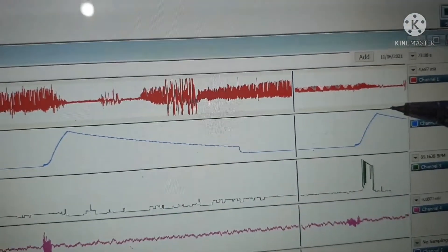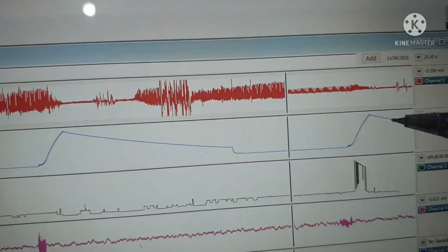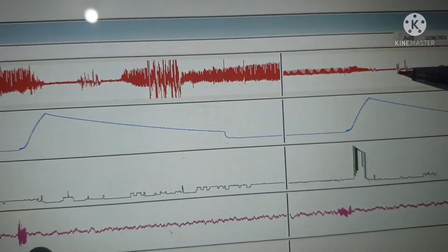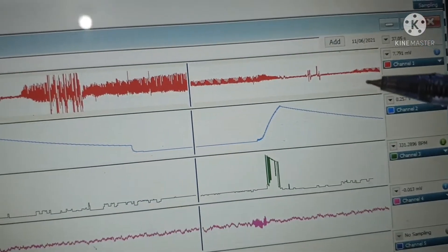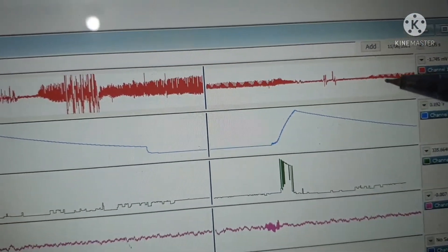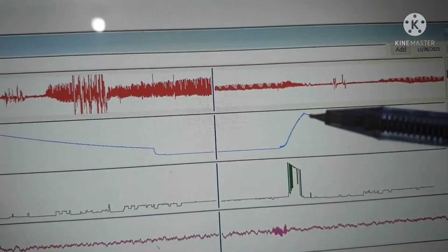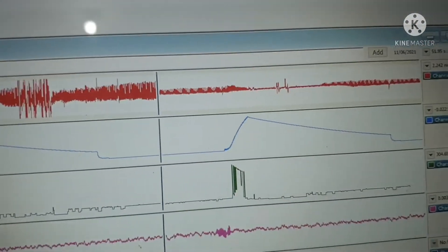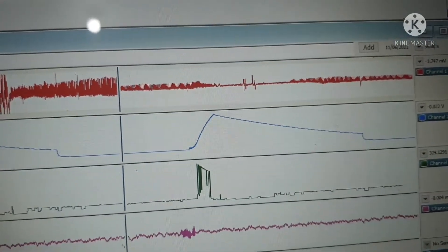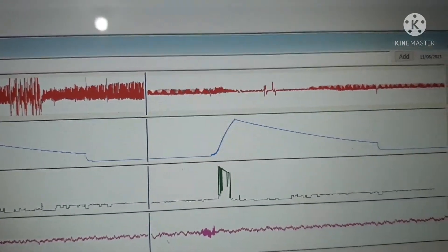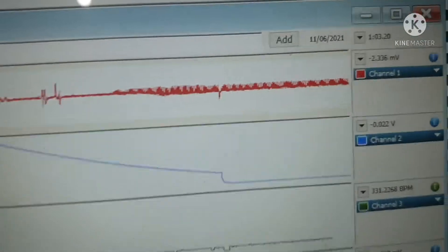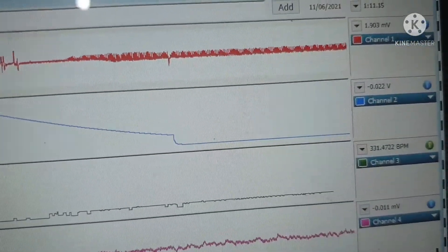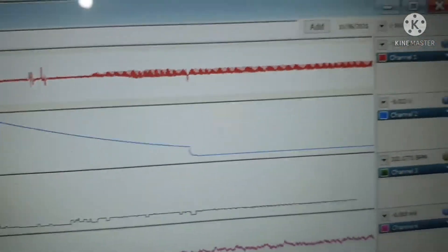The second channel is recording the blood pressure and the first channel is recording the pulse. As pressure increased, the pulse is gone. Once the pulse appears again, this will be the systolic point and this will be the diastolic point. We will calibrate this in a moment. The pulse value is recorded in channel 1, whereas in channel 2 the blood pressure is recorded but it is not properly calibrated.